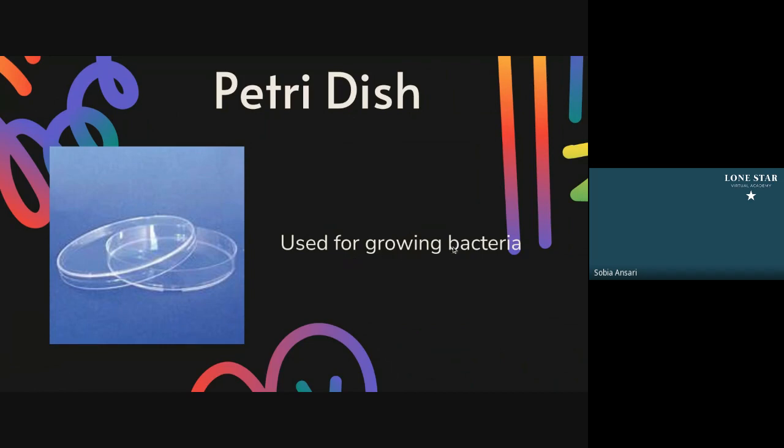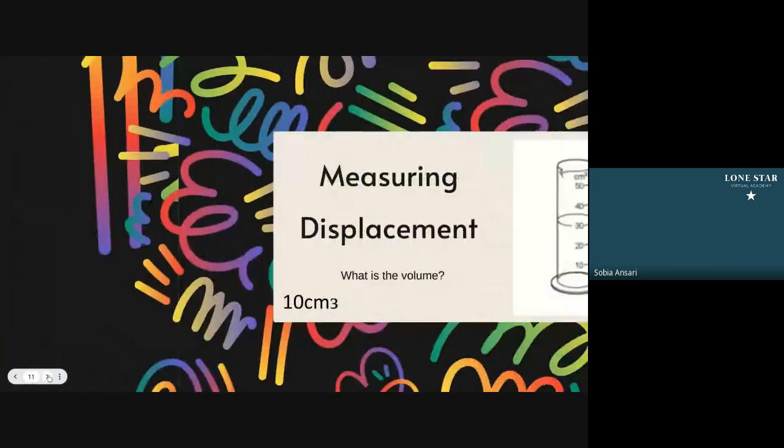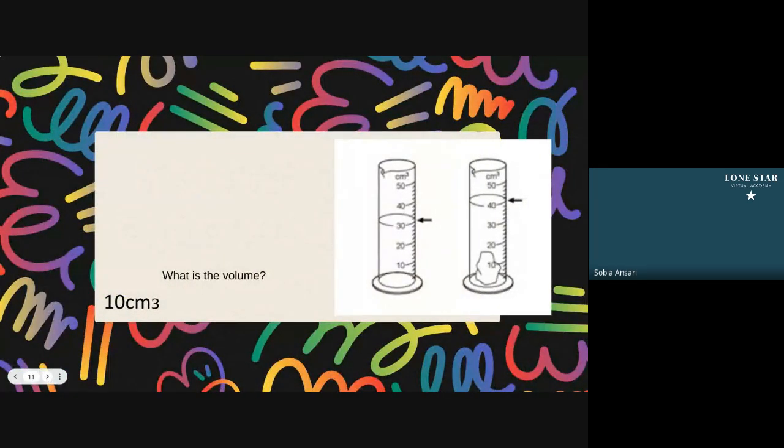Here we have a petri dish. This, as we talked about in one of our live sessions, is used to grow bacteria or other microorganisms.